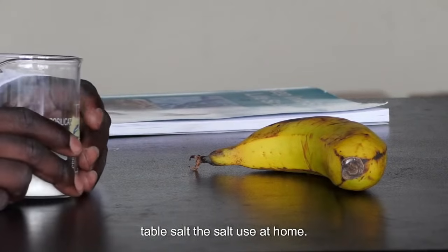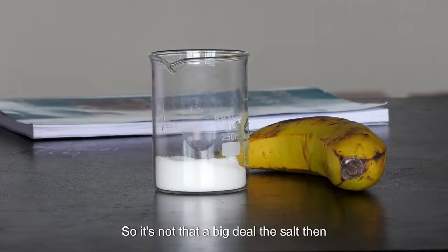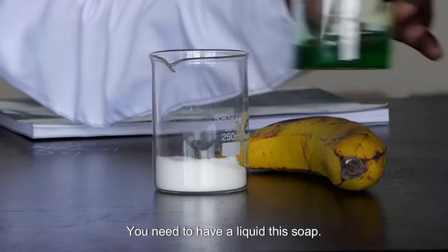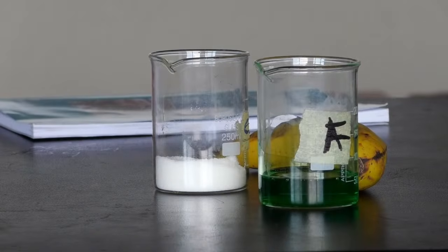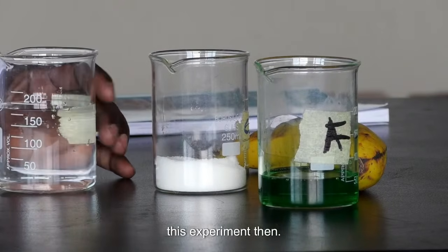Table salt, the salt used at home, so it's not that big a deal. Then you need a detergent or liquid soap, so it's supposed to be there. Then you have to have water. You're supposed to have water to do this experiment.